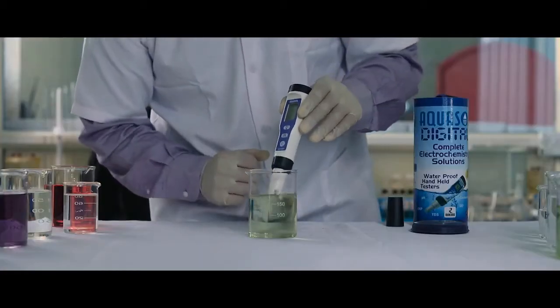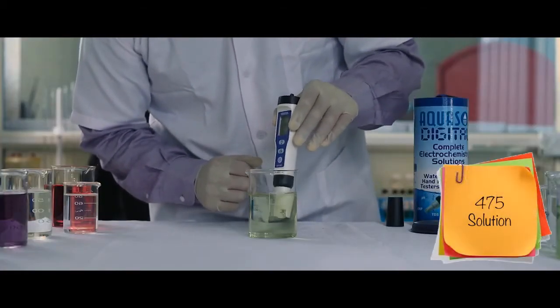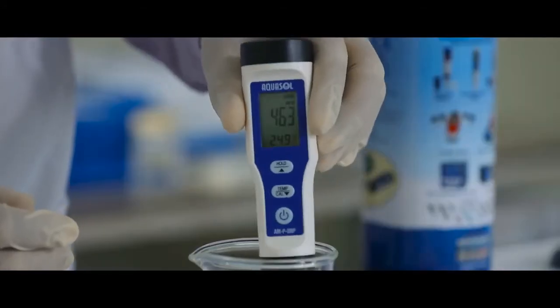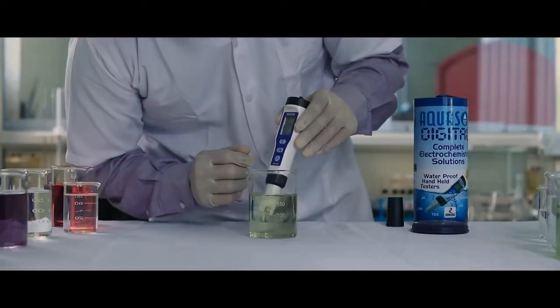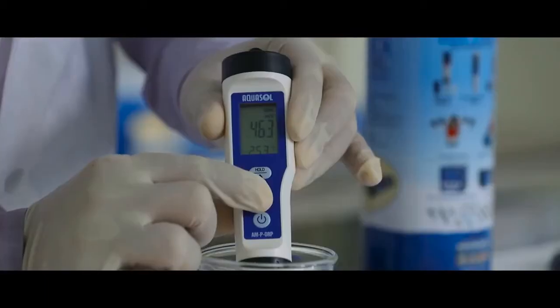Calibration: Dip the electrode in the 475 standard buffer solution. Stir gently for a stable reading. Press and hold the CAL key to start calibration.